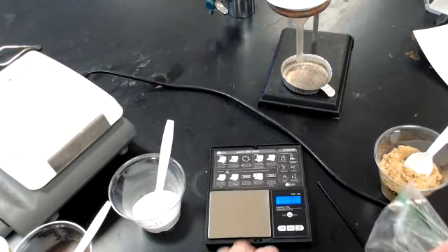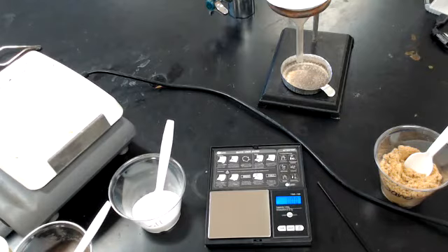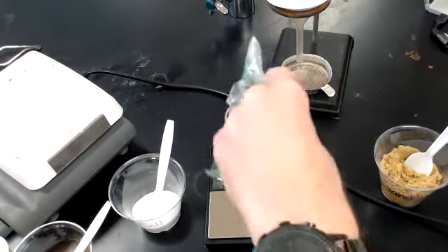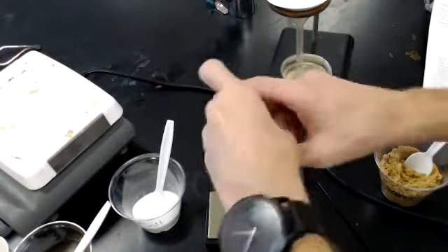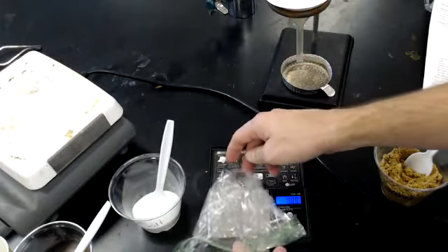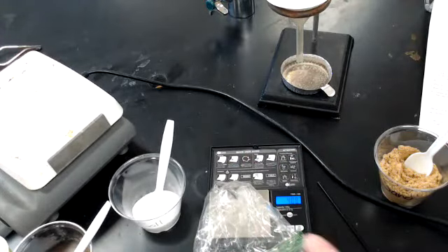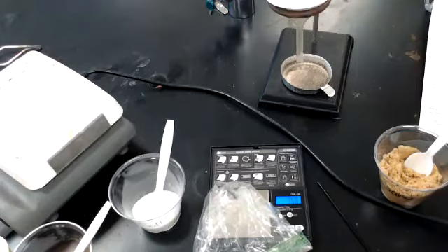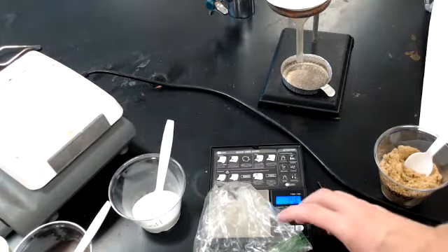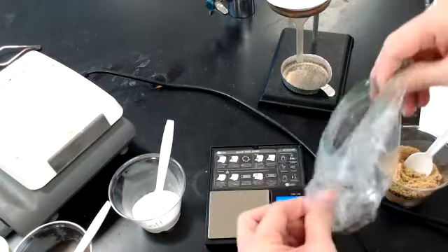I'm going to turn on my scale again. All right. I'm going to put my baggie and try to get most of the bag and the iron to sit on top of the scale. We'll see how well this works. It's not necessarily always the greatest. Let's see what I get. 3 points something. It's still moving because that bag is going to collect a lot of wind, and so the wind's going to make it move a lot.